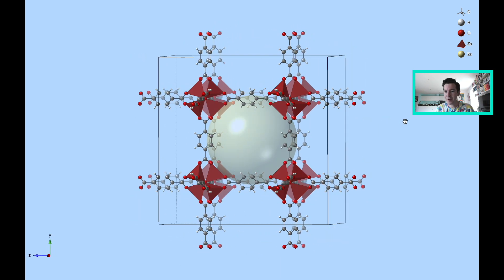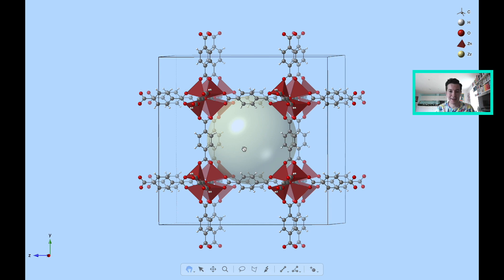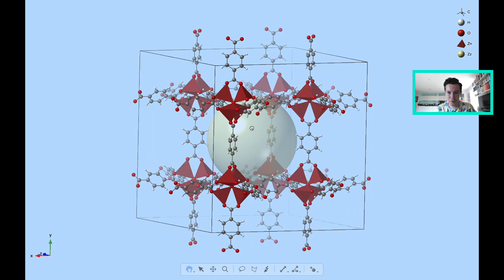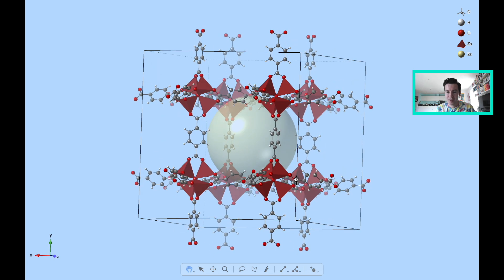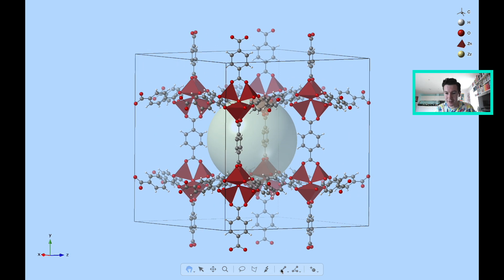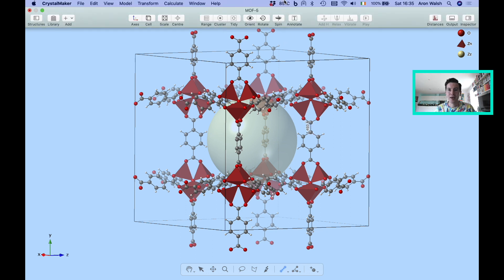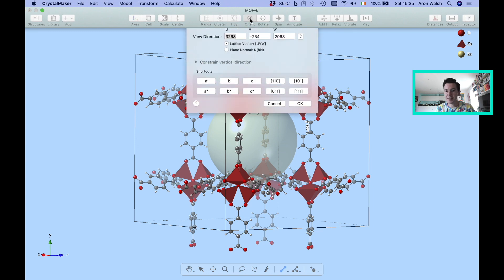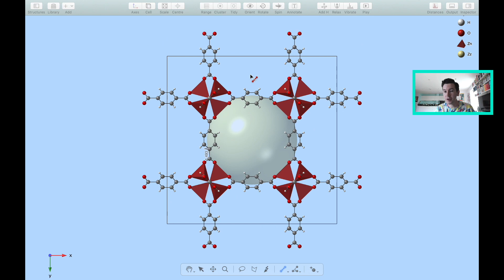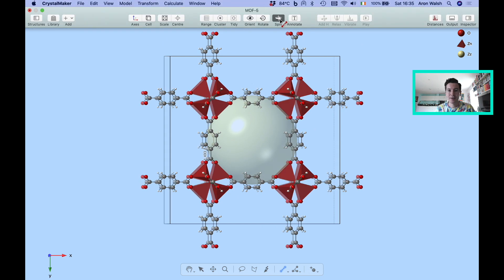The central sphere is just showing the cavity inside the crystal. These are known as very high internal surface area materials, which makes them useful for gas storage and catalysis. The software enables you to rotate, and you can also perform tasks like checking bond lengths. For example, the distance between this carbon and this carbon is 1.493 angstroms. I could label this bond, and from the top toolbar I can do many things — I can orient along a particular direction. If I look along the c-axis the crystal looks like this, and I could spin it.